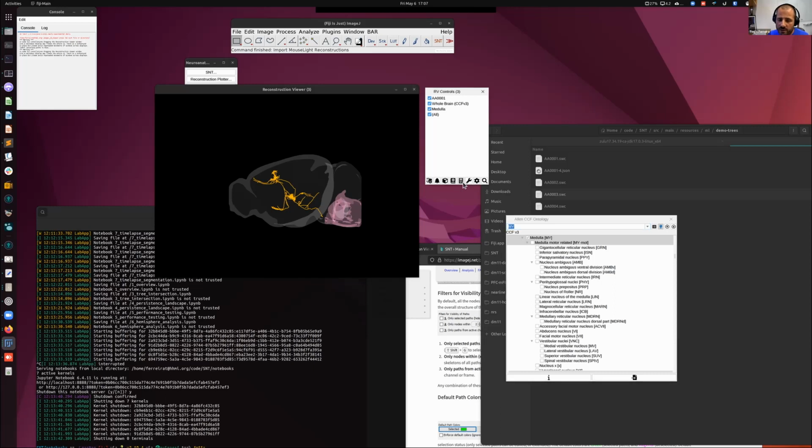And if you want to find out to which areas this particular neuron connects, you can look, for instance, at the cable length across regions in the brain. You can even distinguish ipsilateral. I'm just going to show an example, it's going to be easier to understand.